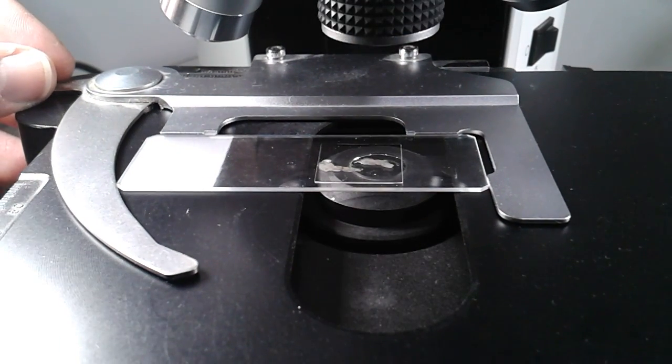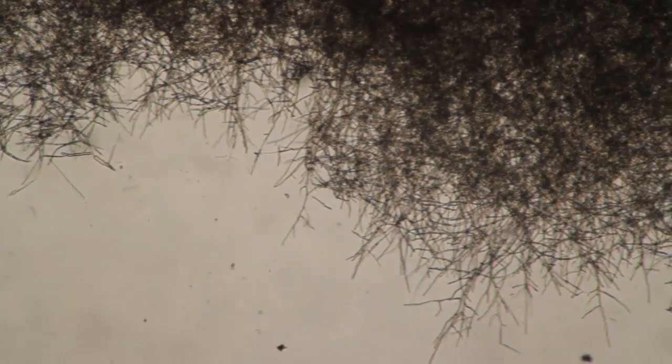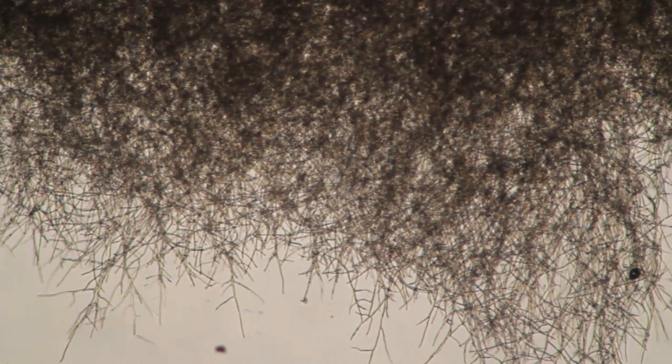I center everything. And then let's have a look at it under the low magnification 4x objective. We can see a very dense network of cells, very string-like.